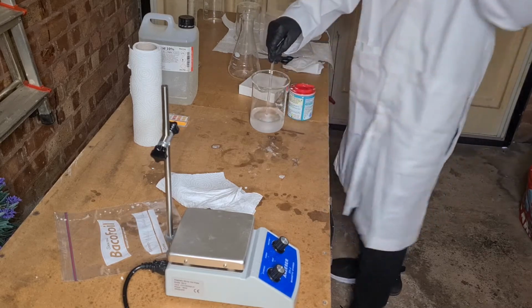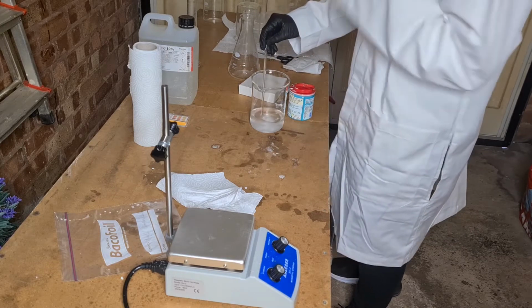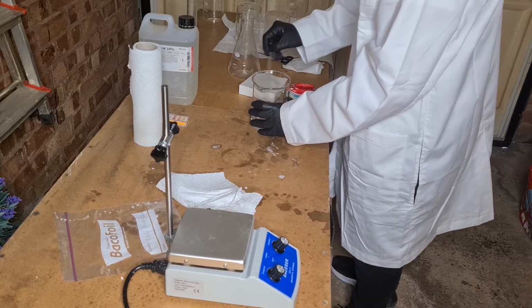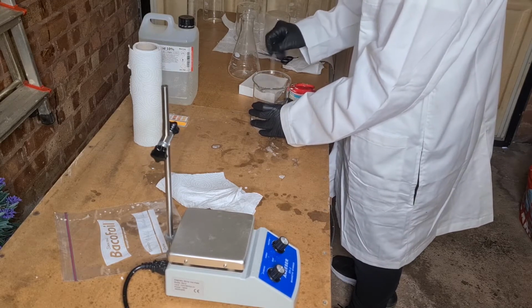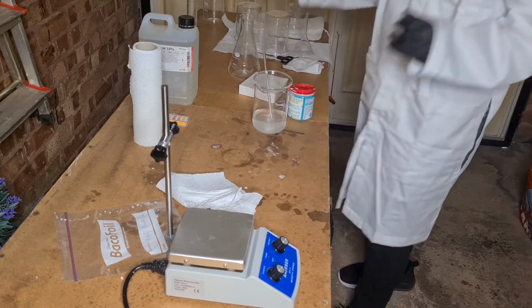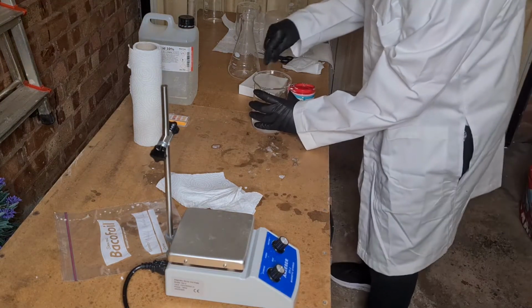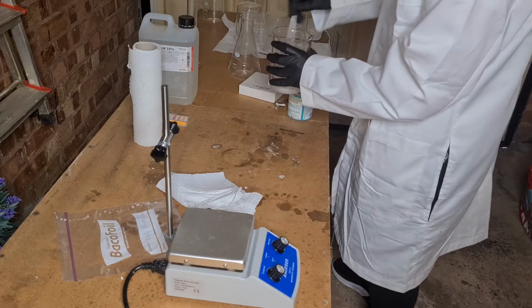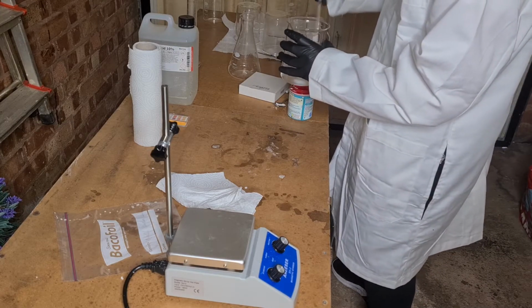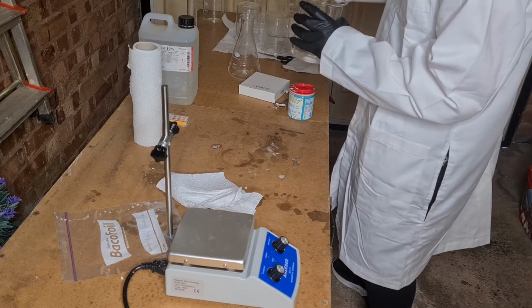Oh, my goggles are steaming up, that's not ideal. No, I shouldn't have done. That's really not ideal. But it is what it is. I'm going to just go defog my goggles real quick. Be right back. Hello, I'm back. I have defogged my goggles. I'm going to keep stirring this now until we get a colourless solution and as much sodium bicarbonate has dissolved as possible. And I do see wood filings. That will get filtered off as fine.